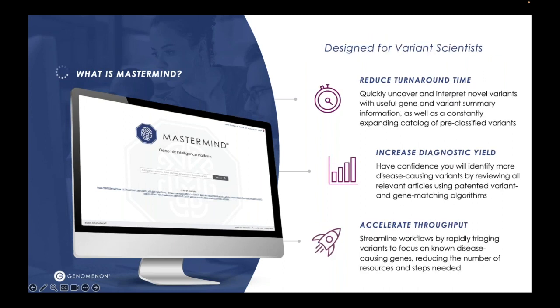Mastermind is used by thousands of labs all over the world to quickly uncover and interpret novel variants with useful gene and variant summary information. Have confidence you will identify more disease-causing variants by reviewing all relevant articles and streamline workflows by rapidly triaging variants to focus on known disease-causing genes. Next slide, please.